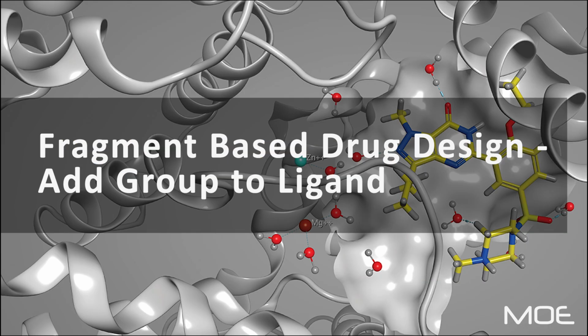Today I'd like to demonstrate the tools that we have in MOE for fragment-based drug design. In this session we'll be exploring the Add Group to Ligand operation, which is a useful operation when we want to grow a ligand into a subpocket or perhaps take advantage of a key interaction with a specific residue. So let's get started.